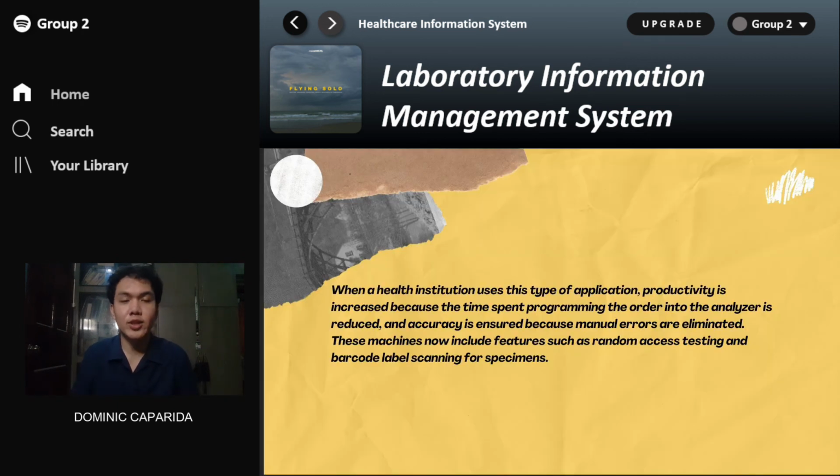When a health institution uses this type of application, productivity is increased because the time spent programming the order into the analyzer is reduced, and accuracy is ensured because manual errors are eliminated. These machines now include features such as random access testing and barcode label scanning for specimens. So this is what LIMS, or Laboratory Information Management System, is all about. It serves its objectives and purpose, which is to increase the productivity of the staff. The staff are efficient in their work, in the analysis of specimens, test results, or samples, by using this LIMS software.